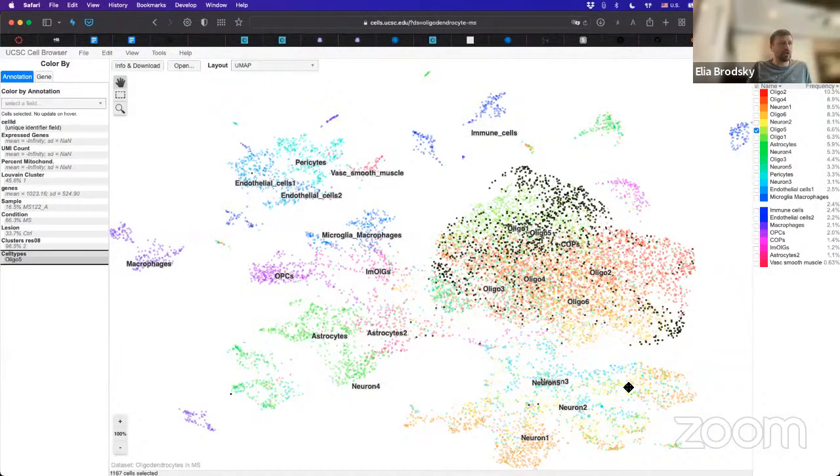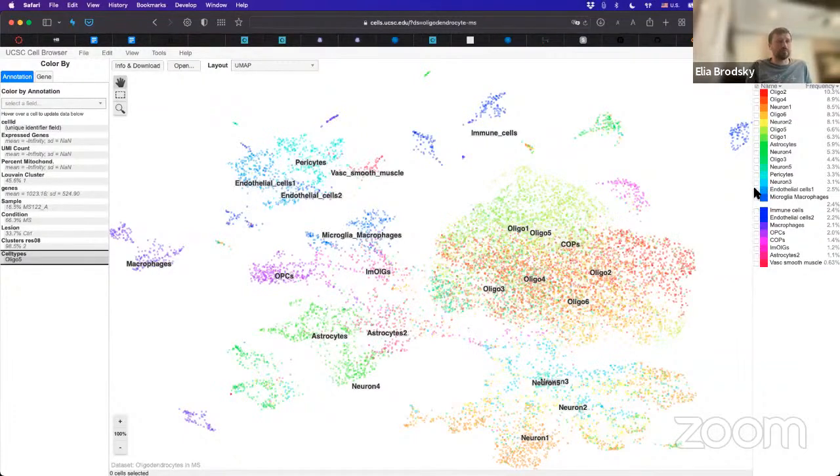So a lot of these types of references give us the strongest signal that we have. Not all of them are so clearly differentiated from each other, right? Some of them are, but not all of them. Okay, so here, for example, endothelial cells, microglia, right?